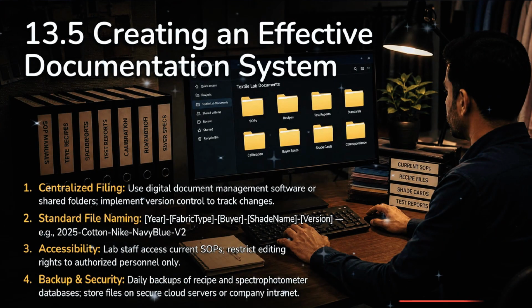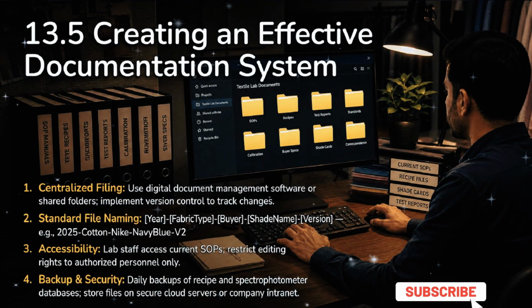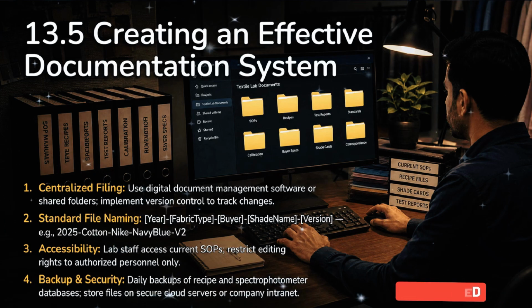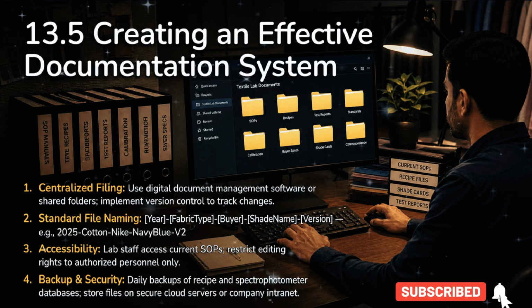To create an effective system, implement centralized filing with version control. Use a standard naming convention to keep files organized. Ensure accessibility for relevant staff while maintaining strict security and backup protocols for your data.